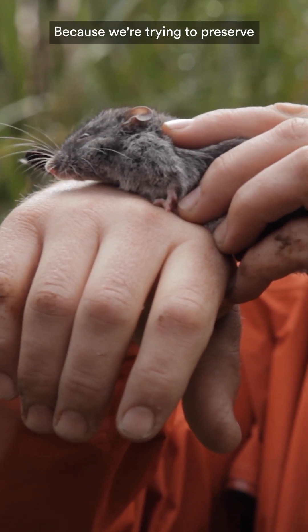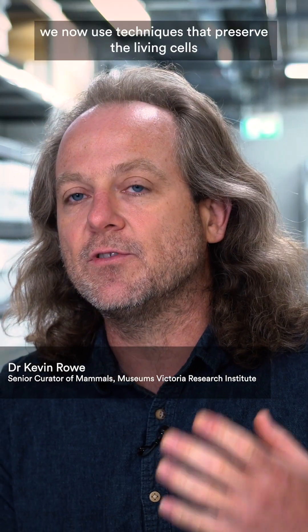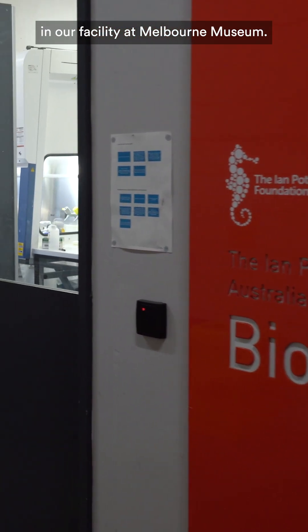Because we're trying to preserve the genetic diversity that's living in populations today, we now use techniques that preserve the living cells, and we've been able to grow them in our facility at Melbourne Museum.